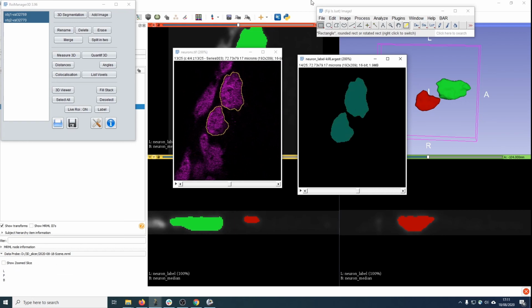Ground truth data is probably good. This is actually good for generating ground truth data, but I've also used this for segmenting really hard to segment images using the traditional techniques in ImageJ. I've used 3D Slicer quite successfully.